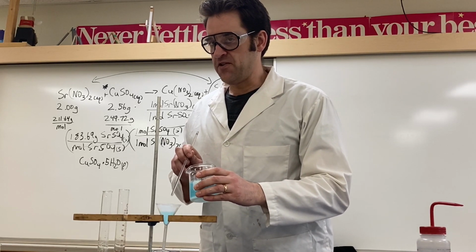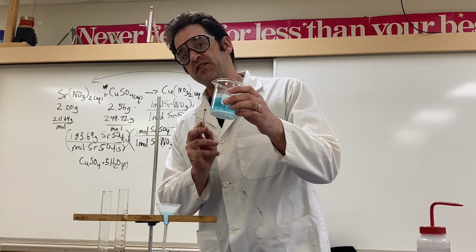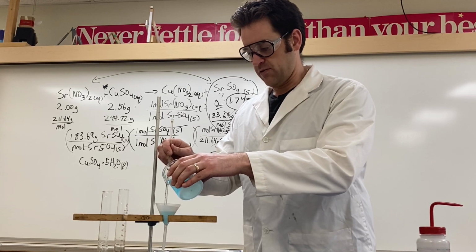Okay, I'm going to do this one more time, and then I think we'll just jump to the end. You can see we'll also have to get all of that precipitate out, and then rinse the flask, or rinse the beaker as well to get it all out. So one more time with the awesome decanting technique. So look at that go.